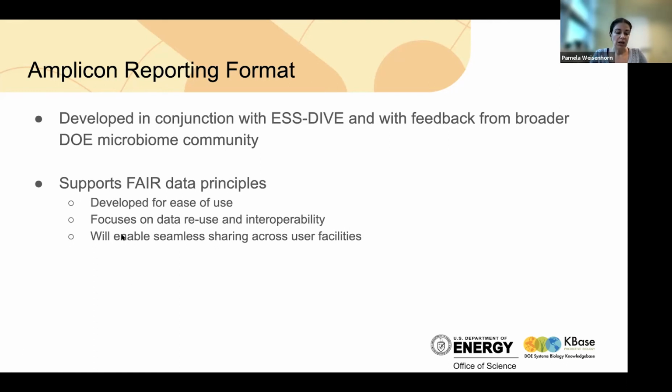Right now, you'll see that you have to enter the data into KBase directly, but the plan is once APIs and everything get going with the different projects, you'll be able to seamlessly share data across platforms. So if you bring data into KBase and use it there, you'll be able to then push all of that data together as a package to the ESS-DIVE repository if you're a DOE researcher, because they only support DOE funded projects at this point.